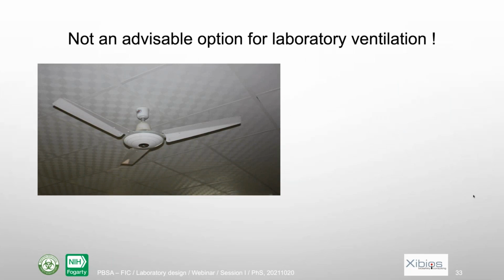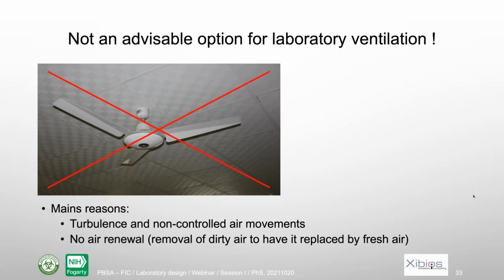This is definitely not a good option for laboratory ventilation for two reasons. Because first, it mixes the air in the lab, and so it doesn't move the air from one place to another. It creates non-controlled air movements, and so if there are some nasty products in the air, you don't have any control of that. Also, there is no air renewal. It will just mix the air in the lab, but there is no replacement of dirty air.